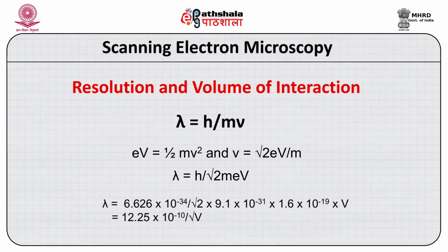However, we must remember that the interaction is not only from an area, but as we learnt earlier, from a depth or from a volume, and the extent of the volume depends on the nature of the geological material, that is inversely proportional to the density and directly proportional to the incident electron beam energy, and that defines the resolution in terms of volume, not in terms of area.